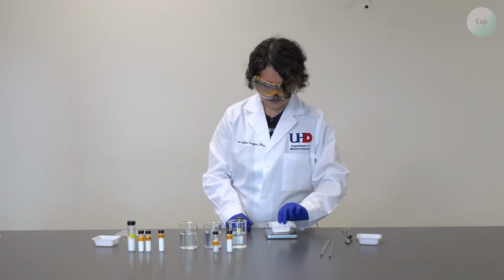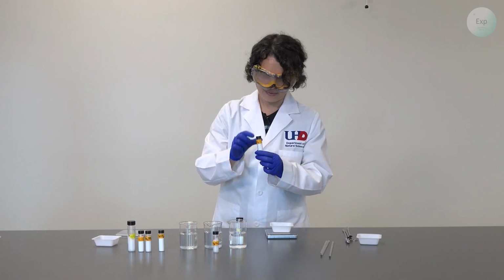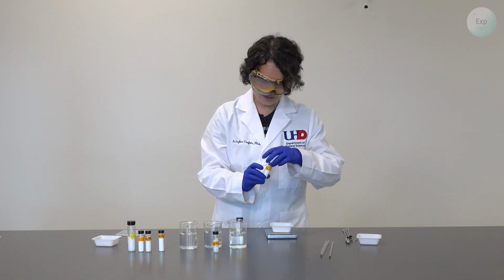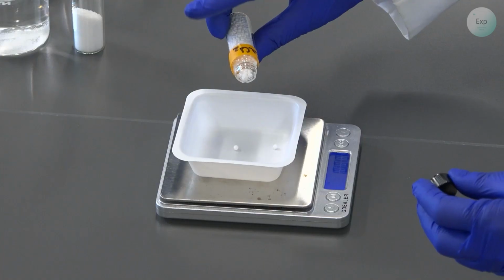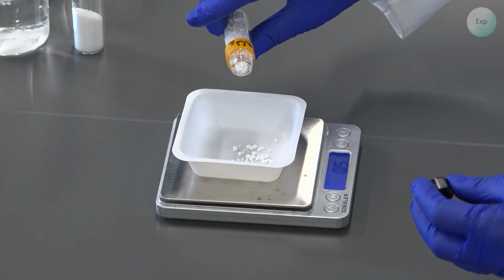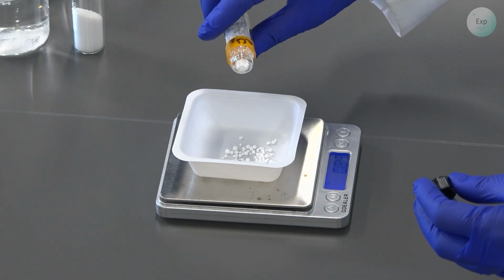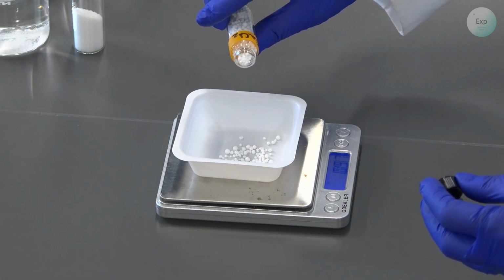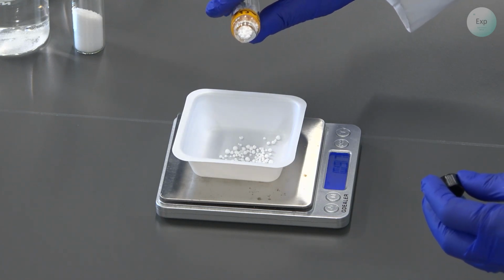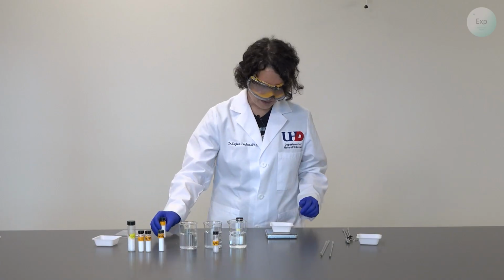Next, I'm going to place another weighing boat, tare it, take my second chemical, which is calcium chloride. I will measure out as close as possible to 1.00 grams. It is a little bit more than that.